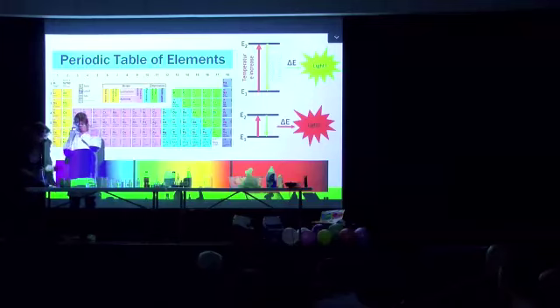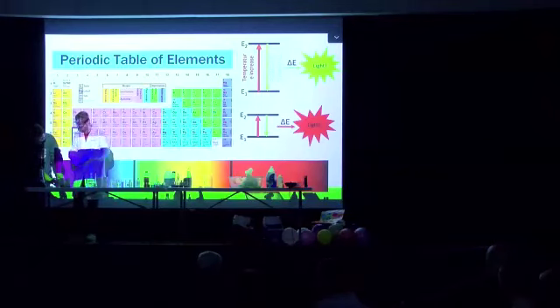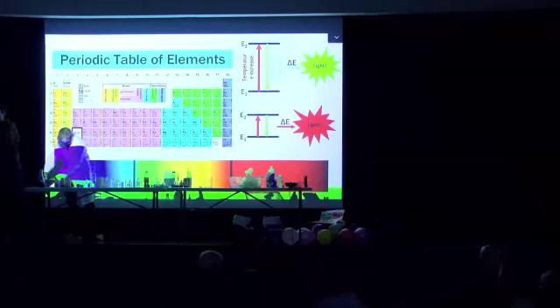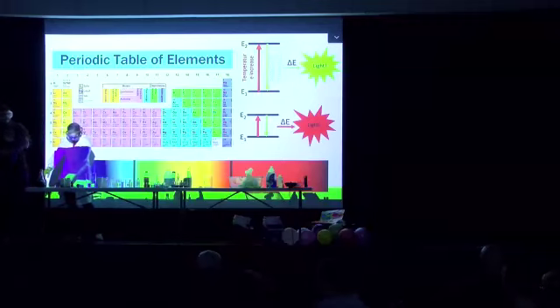All right, and last up we got lead. What color do you think lead will be? Yellow? Kind of this orangish flame with a little purple undertone. Okay. That's all we got for our flame.